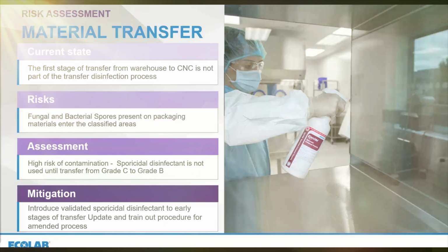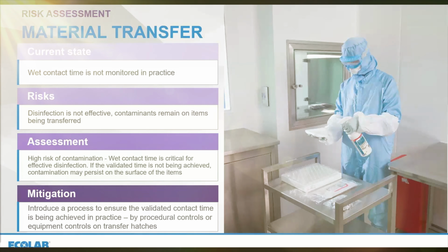Another area that we looked at was around the methodology. So there was no monitoring of the wet contact time being achieved in practice. It was validated, very detailed, and provided in validation documents that a specific wet contact time was validated. But in practice, that wasn't being monitored.